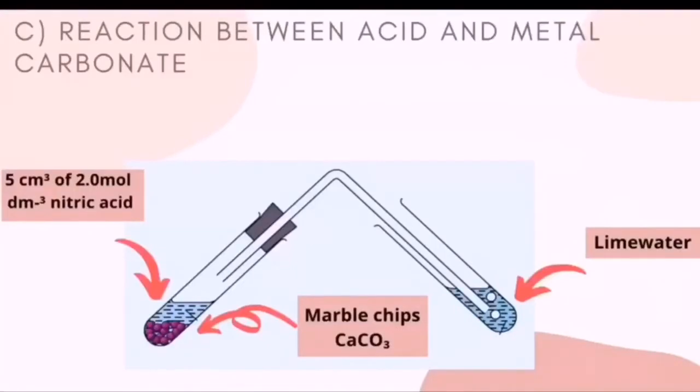For the reaction between acid and metal carbonate, first, pour 5 cm³ of 2.0 mol/dm³ nitric acid and marble chips in the test tube, and lime water in another test tube.